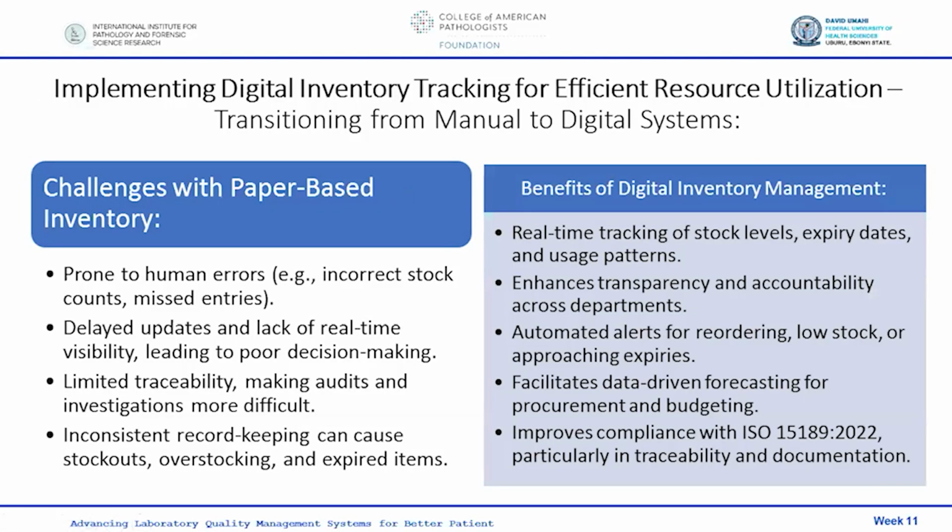Now, let's look at implementing digital inventory tracking for efficient resource utilization. What are the challenges? Because yes, most labs, especially in low and middle income countries, use the traditional paper-based inventory, and it is not without challenges.